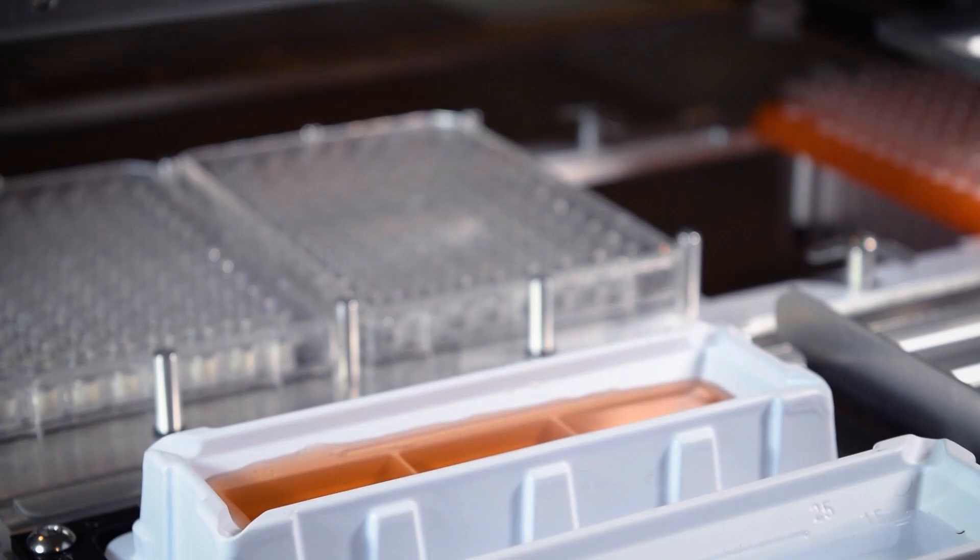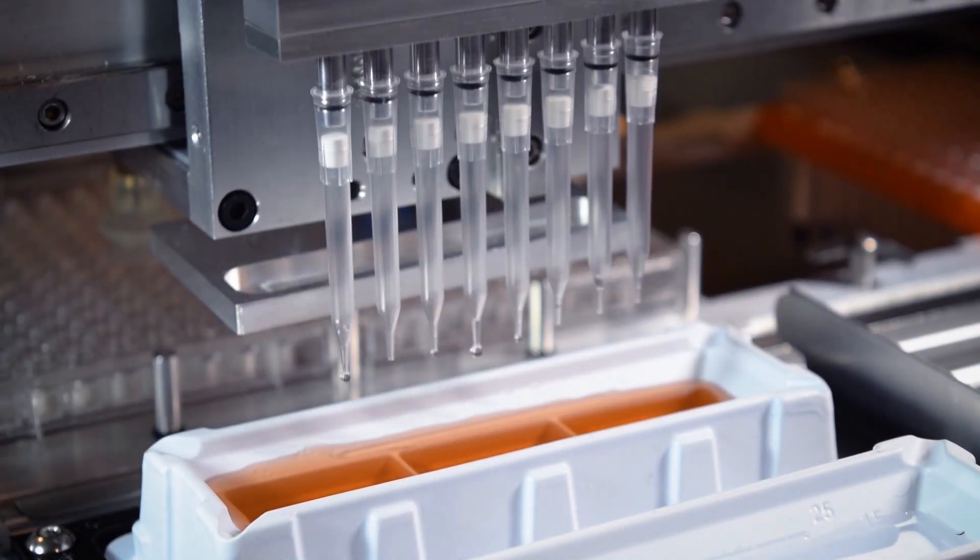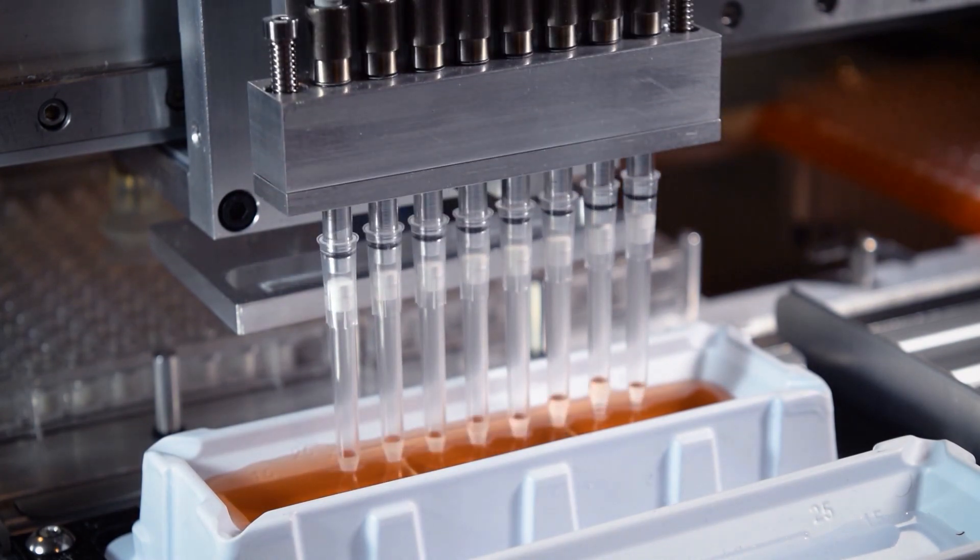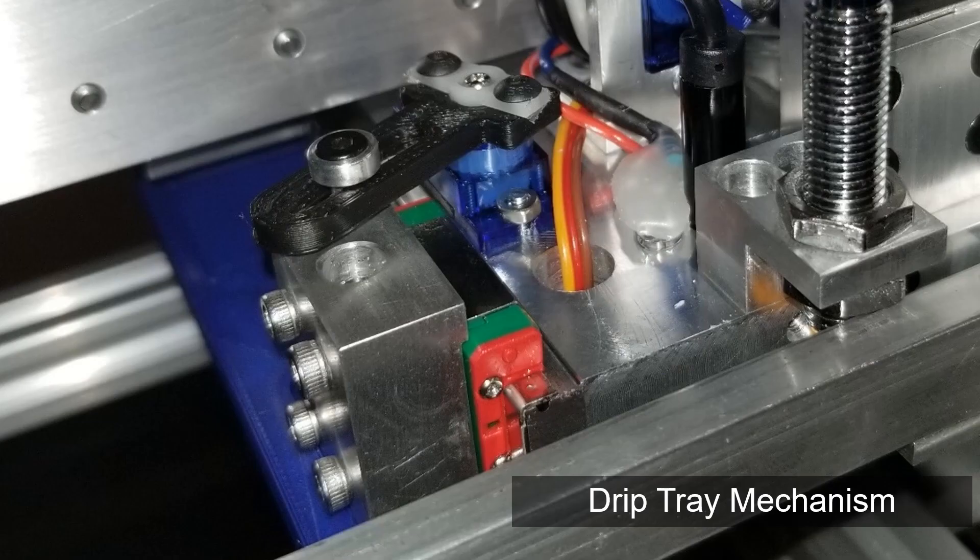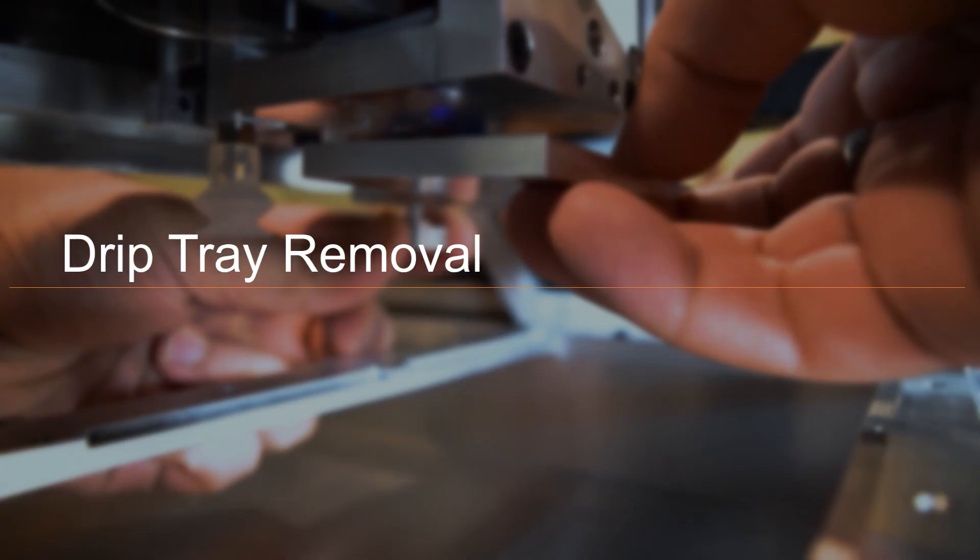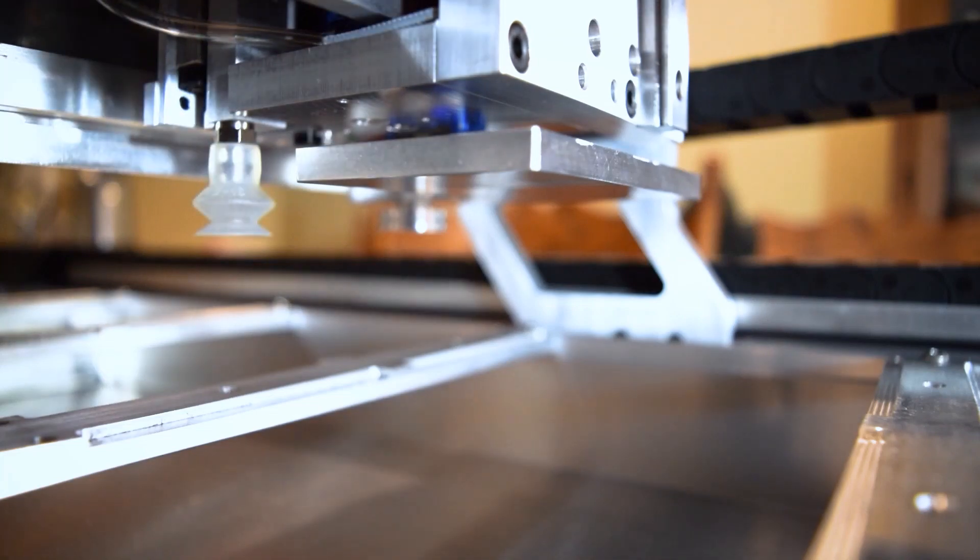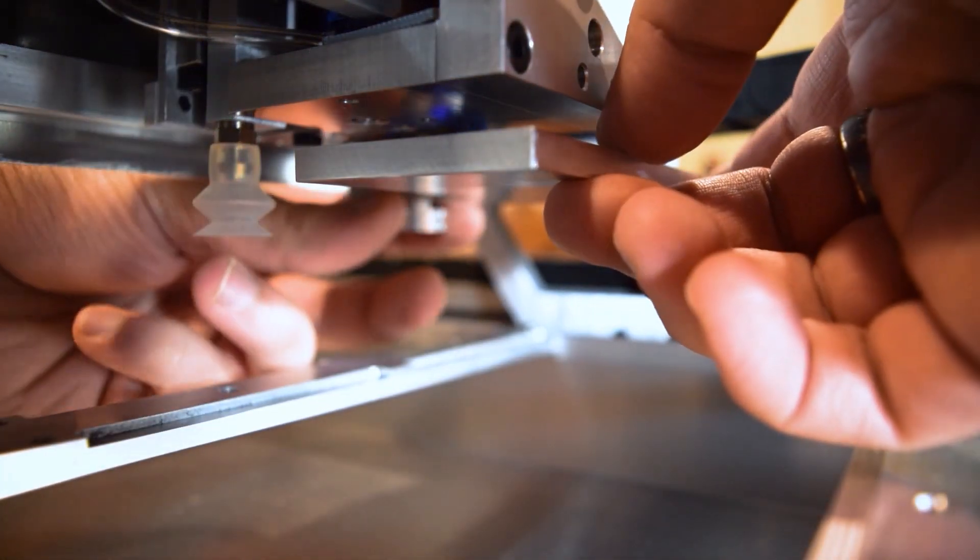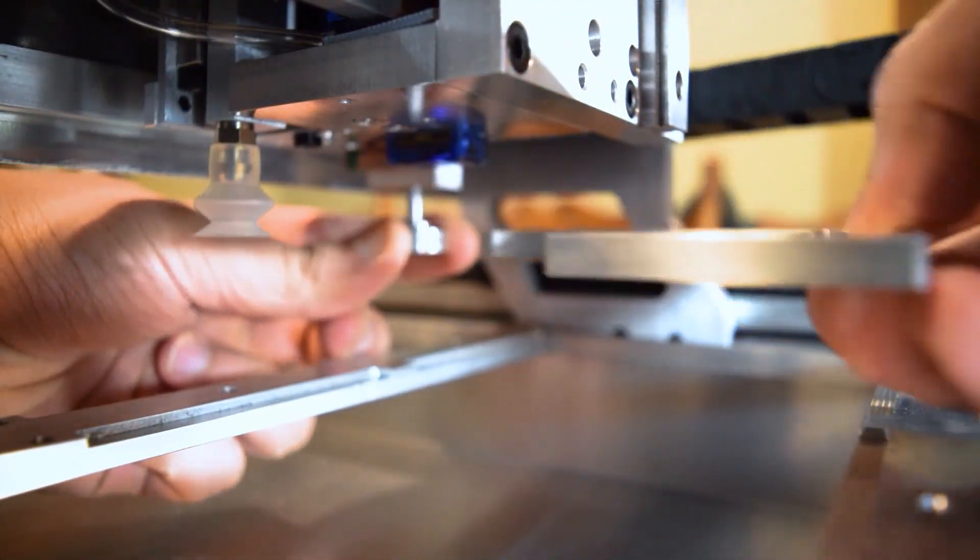A drip tray is mounted to the head of the machine to prevent stray droplets on the pipette tips from contaminating the machine. The tray is actuated using a small servo and a linear rail similar to the vacuum pump mechanism. The drip tray is easily removed via a spring loaded plunger. This allows it to be cleaned easily.